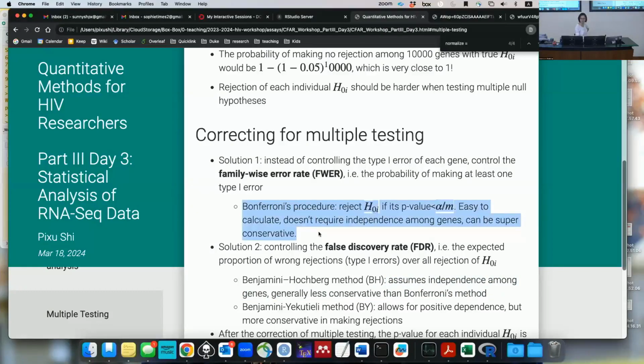Right? Yeah. No, I like to think of it as false discovery rate. It's very much hypothesis generating. Like you're getting a lot of candidates for future studies. If you were to compare the p-values between those two, would they be within the same range? This one is almost always more conservative.